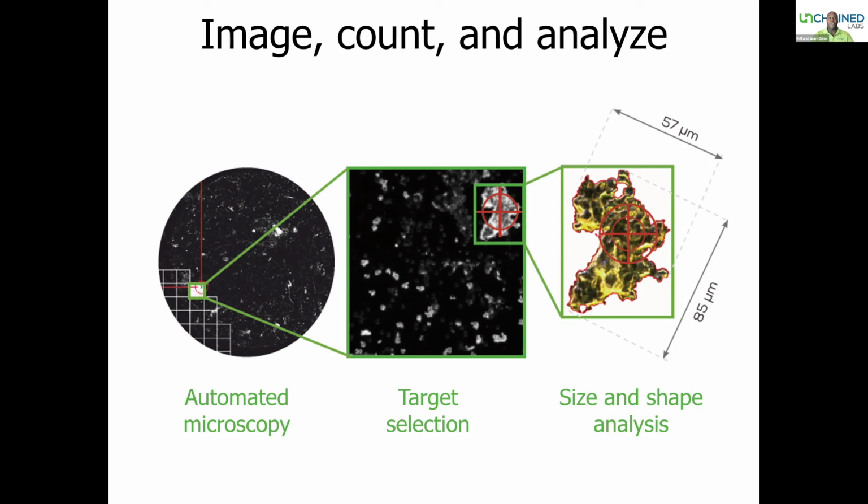So you may say, only show me things that are visible, right? So above a certain size, from one range, one number to another, and they will only show you those. Or you can say, show me everything and put them into different buckets. And the sample distribution can be completely automated using the Hound, and we can see exactly how that can be useful.